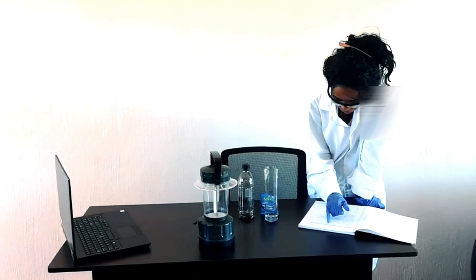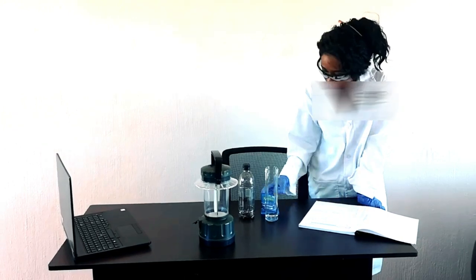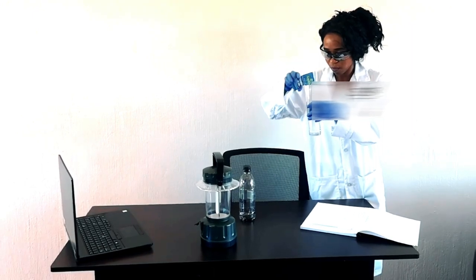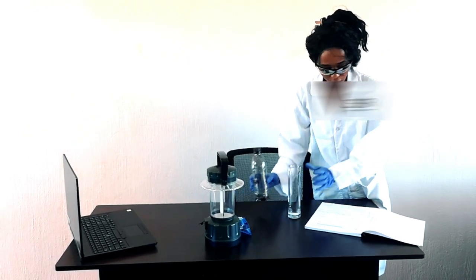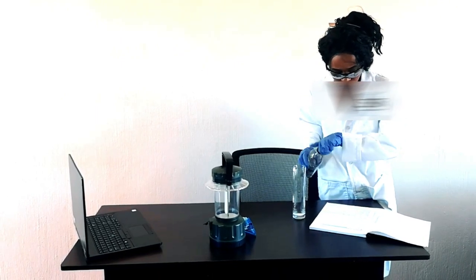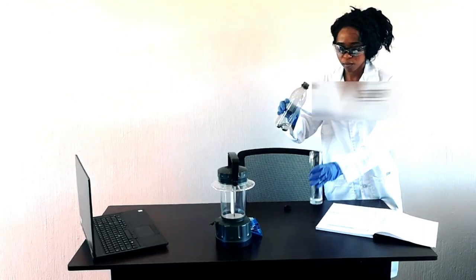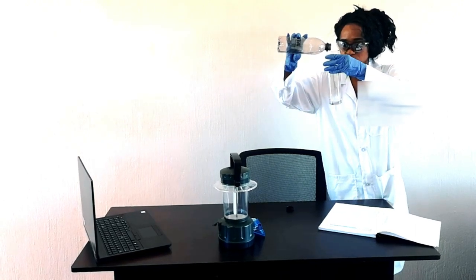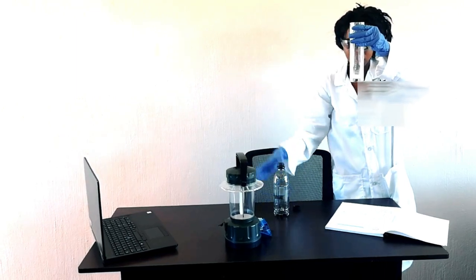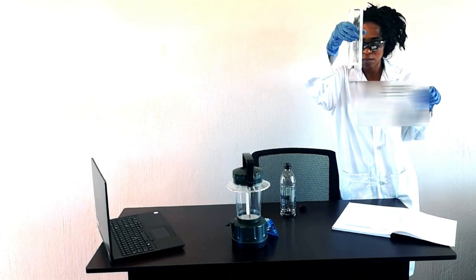The mistake that people make is that they do their lab work, and once they're done, they go to a common area without removing their gloves and start touching things. In this video, I use this laptop as an example. Let's say that this laptop is a common laptop. Everybody uses it. I do my lab work and then I go and search for whatever it is that I need to search for with my gloves on. And then I leave. Somebody comes in and starts using the very same laptop. They don't know what I was working with, what chemicals I was working with. And then they use the laptop and then they leave.